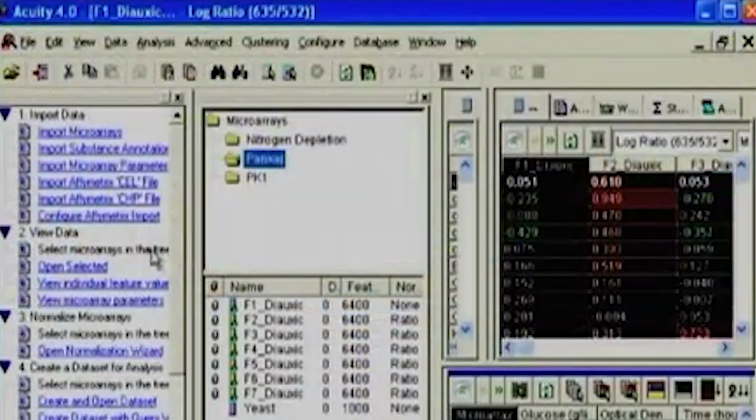So as we described, we first see the import data tab. Basically this allows one to take the data from the microarray database, store it in the form of a GPR file, and allow that to be understood by the Acuity software. We also have the option of text file import, where you define what is available for what. In this fashion, I have defined in the microarrays folder the training, and it says what all different slides are available to us to design.